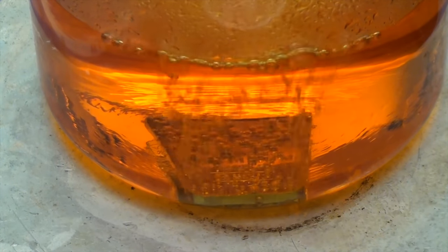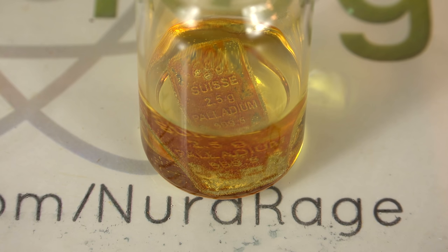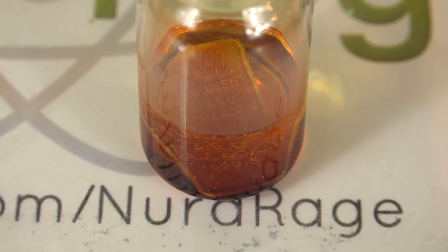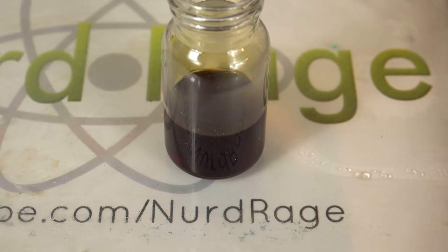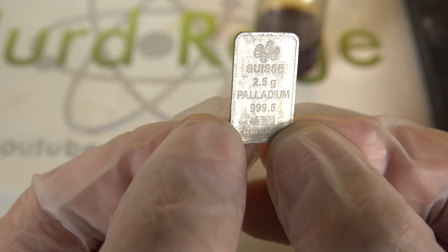This is an interesting contrast to platinum which took days of boiling in hot aqua regia to dissolve. But palladium looks like it can dissolve in nitric acid at room temperature at much faster rates. Perhaps this property can be used to separate the two metals — perhaps the precious metal refiners can chime in. Meanwhile over here I now have 112mg of palladium metal dissolved in 10mL of nitric acid. Palladium nitrate is an interesting chemical in itself and I'll probably evaporate this down and crystallize it for use. Palladium is a tremendously useful catalyst in chemistry and I'll see if I can explore some of that in future videos.